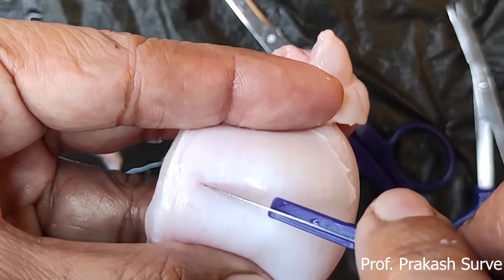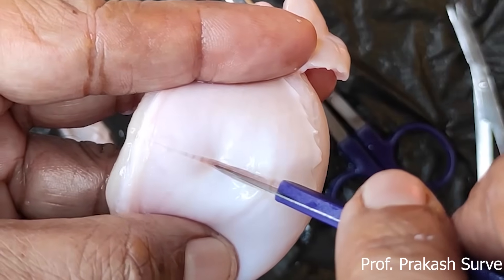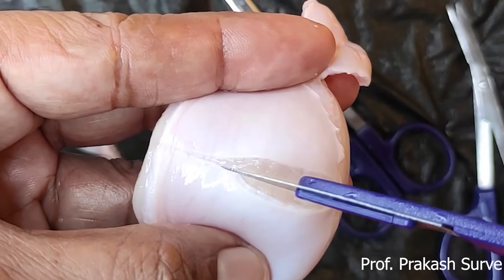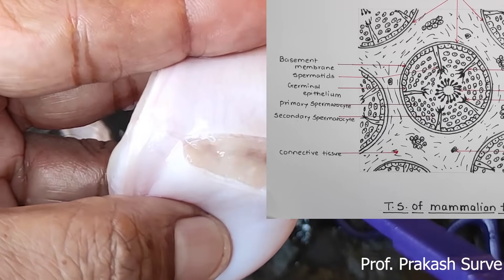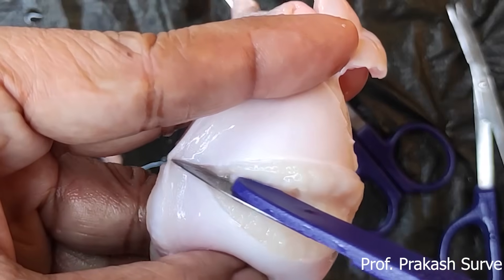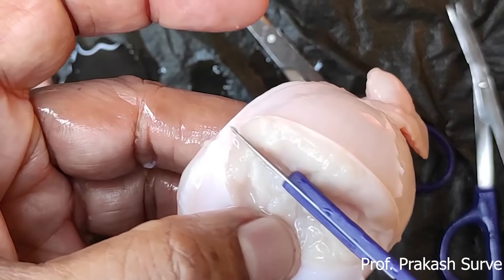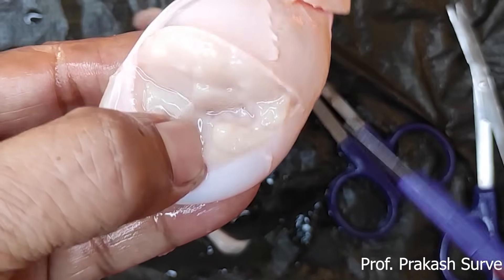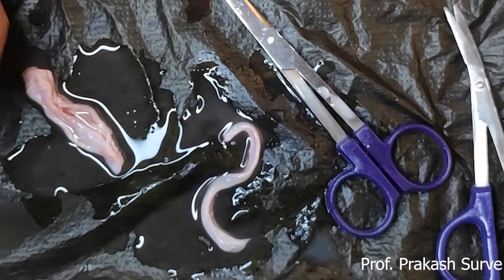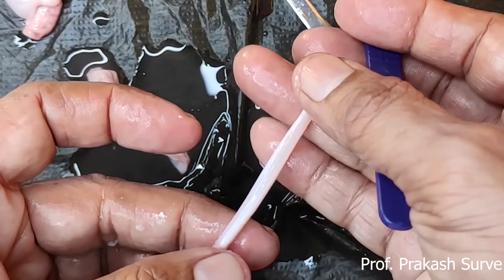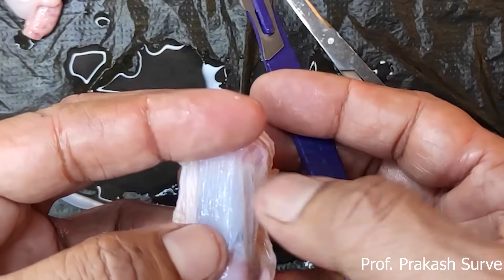We will take the transverse section and try to check how it looks. This tunica vasculosa — first we will cut that, then we can get the inner structure about the testes. It is very difficult to understand how the seminiferous tubules are arranged here, because the color is a little bit transparent, which is why it's difficult to observe. What I am holding is the vas deferens. This is about the tunica albuginea, which is a collagenous connective tissue layer.